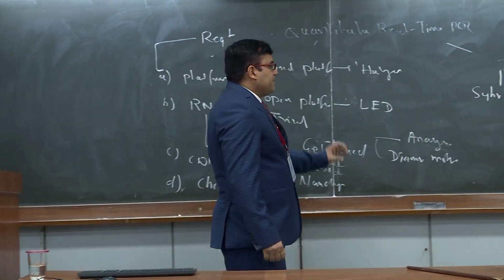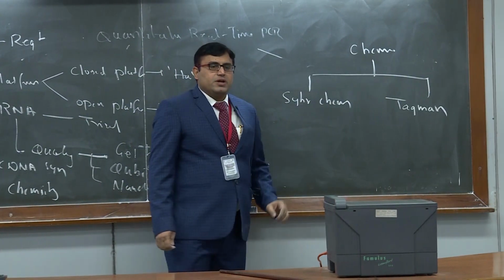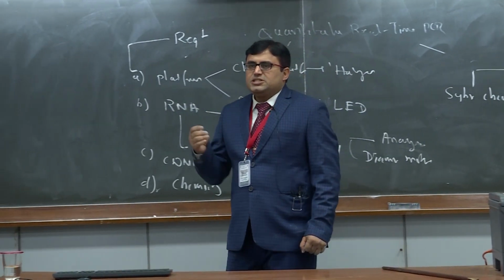Here we are going to use a pair of primers, that is forward and reverse, which is basically a gene-specific primer.